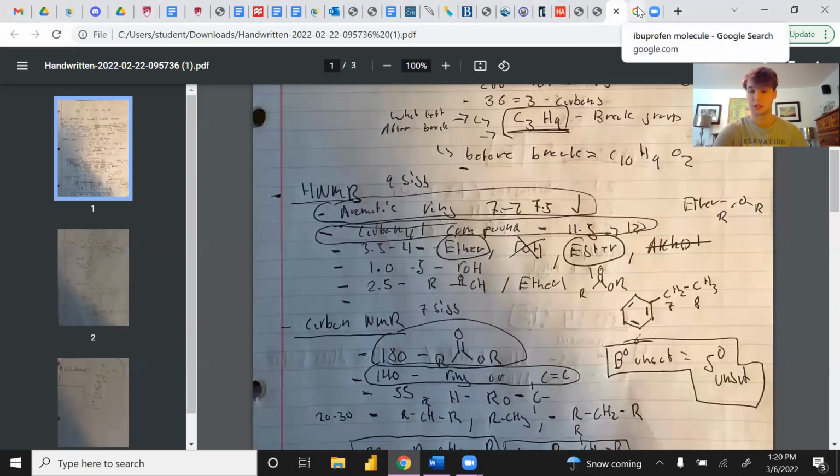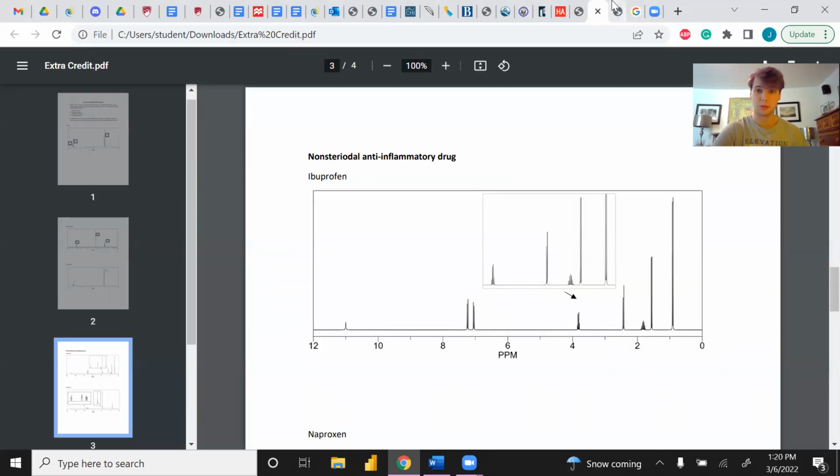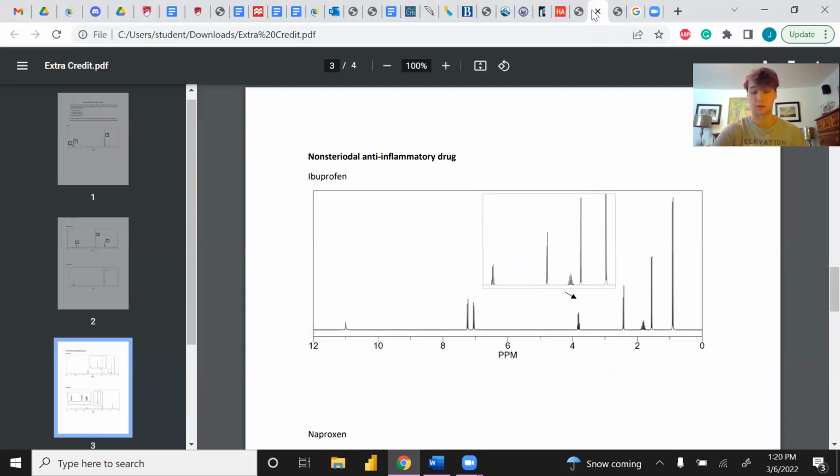are due to positioning, number one, because the number of signals is dependent on each environment. And then number two, sorry, I have a lot of tabs open. Where is it? There it is. It's also due to all these double bonds here. So double bond, double bond, which are part of the aromatic ring.